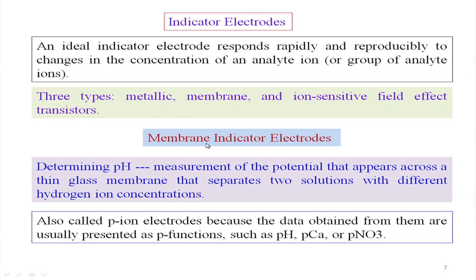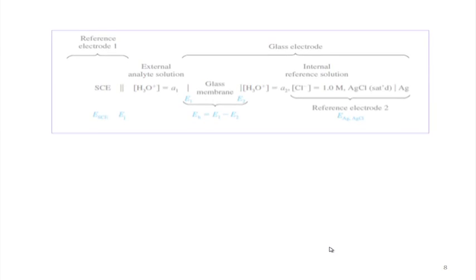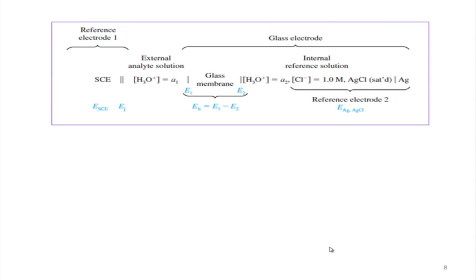But you have to design a corresponding membrane electrode, or the membrane indicator electrode, which should be selective for your calcium ion or the nitrate ion. So, like that of your hydrogen ion, here we take the examples of these two things, that means one is the typical cation and another is the typical anion. So, how to place all these together?